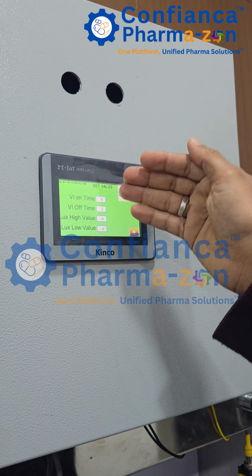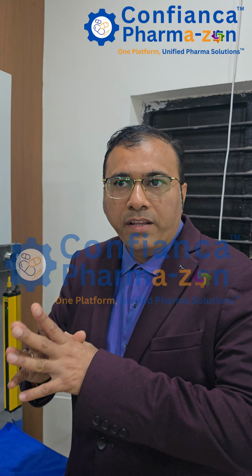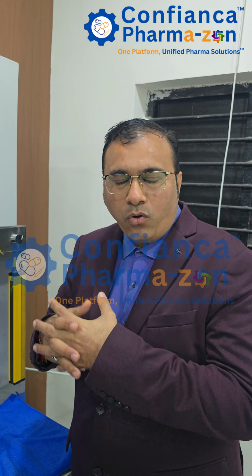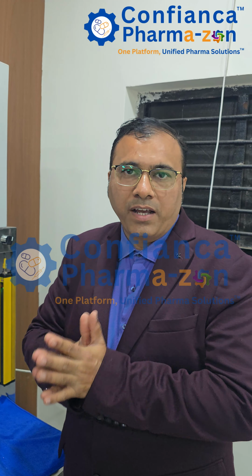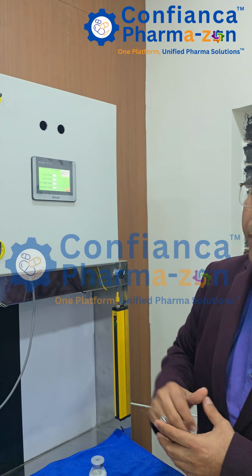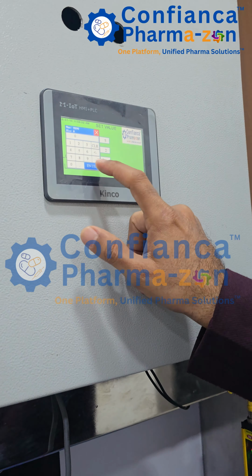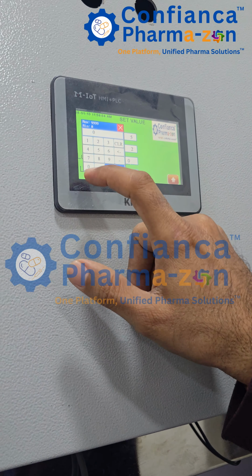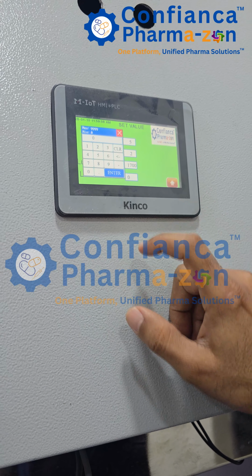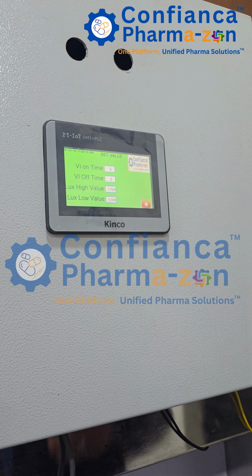What are on time and off time? On time is the duration for which you want the visual inspection booth to run for your visualization, and the off timer is the fatigue time, as per the guideline. You need a fatigue time of at least 5 minutes after 55 minutes, so that people get a rest. Then the lux high value, let's say 1700 right now, because we have put only one LED, and the low value, let's say 1100. You can set this as per the requirement.